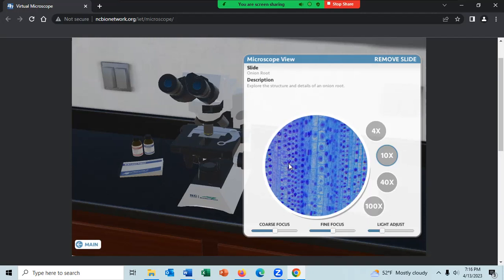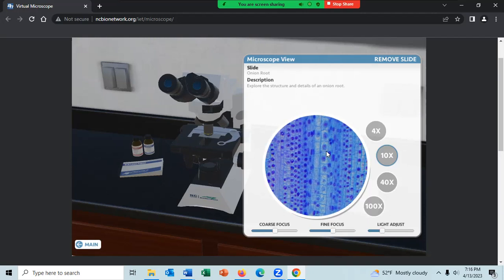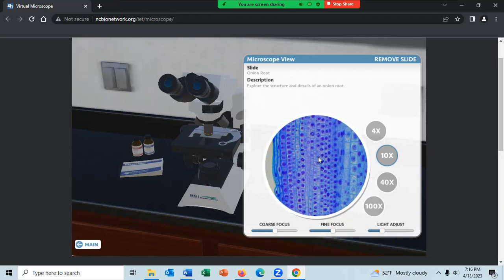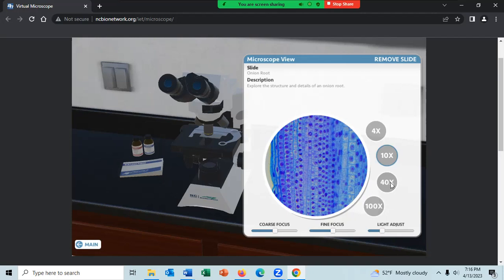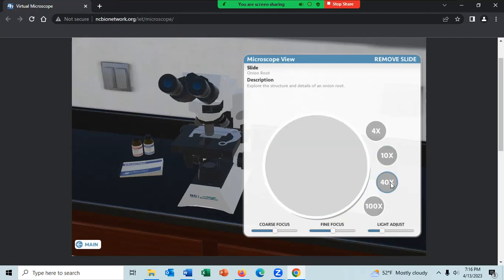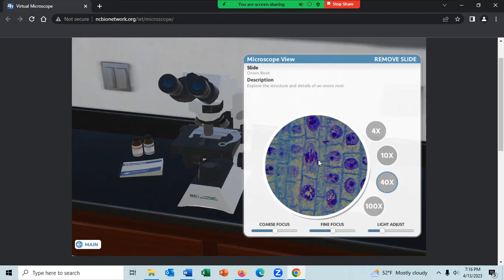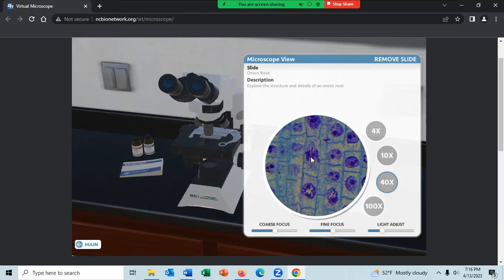That's currently the only one I see. That could be one, but we'll have to find focus on that. We'll try this one. That could be one there too. All right, let's move to the higher power lens. Oh, good. I do have one. There. Chromosomes we're seeing. And let's find focus to get that in the sharpest position we can.